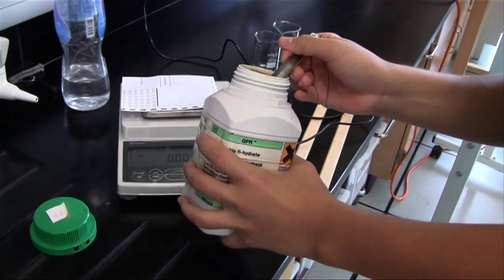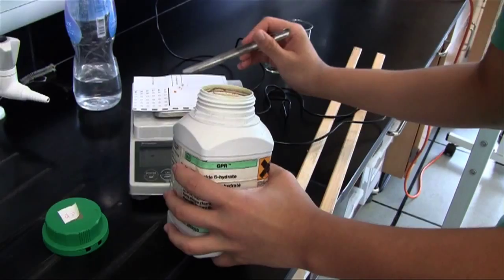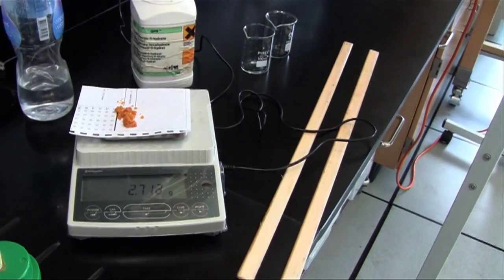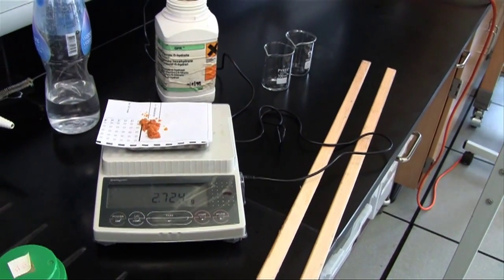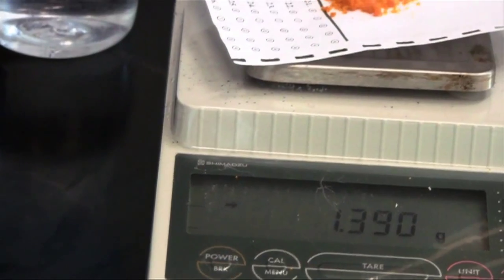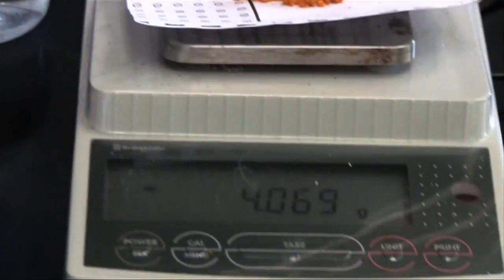The iron 2 chloride and the iron 3 chloride create the response to the magnetic field in the overall fluid. Here we are measuring out four different concentrations of iron 3 chloride.